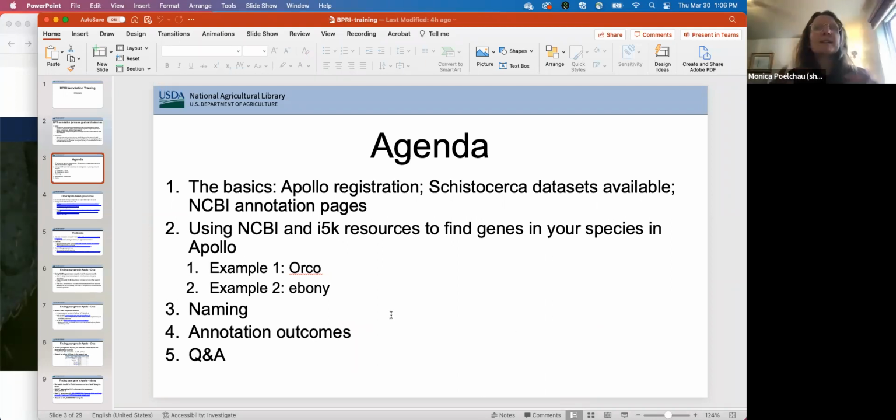Indeed. And then, a couple other things. So naming is one. When we think about where we're going to go with the annotations at the end, and if we want to publish them and submit them to NCBI for better data reuse, then naming is the big thing that takes a lot of my time. And so I thought it'd be worthwhile investing some time in explaining this to you, so that we have less of a logjam in that area and things can move forward more quickly.